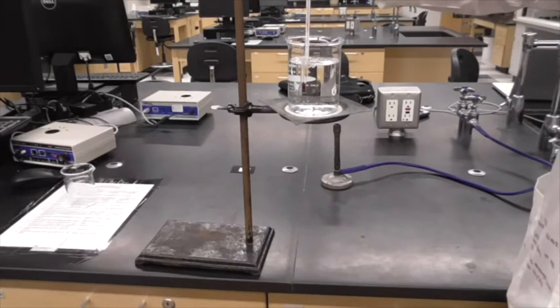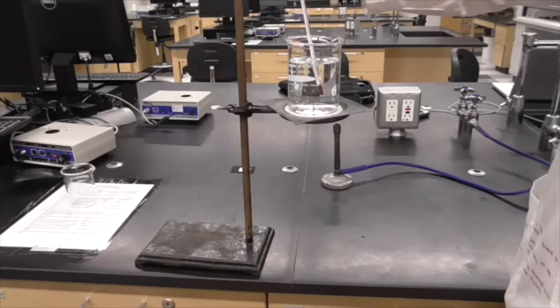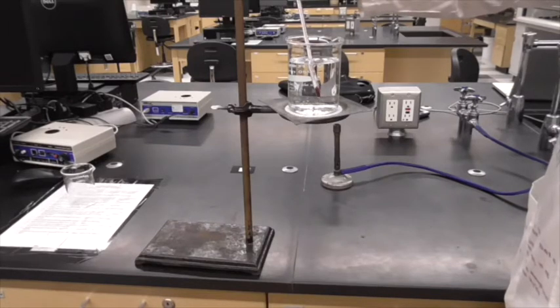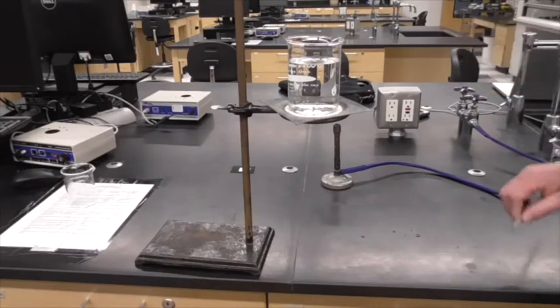With all the heat in there and the glass, it should. About 40. Okay, so now I'm going to go get my sample and we'll get set up to take readings.